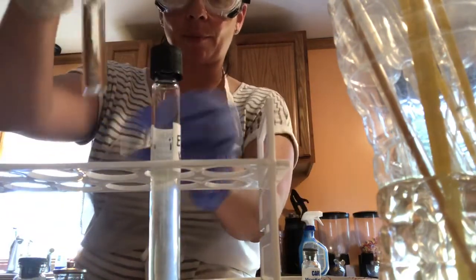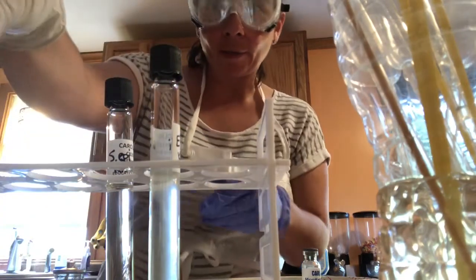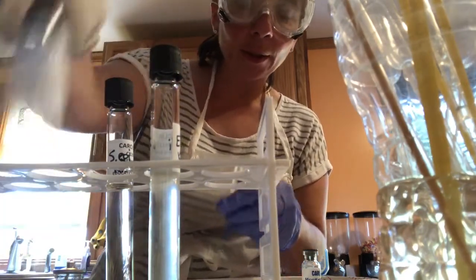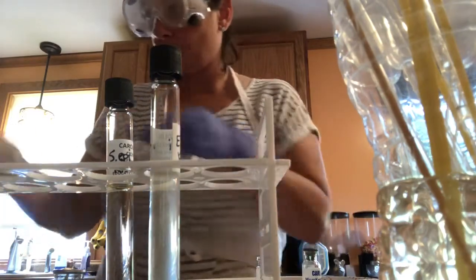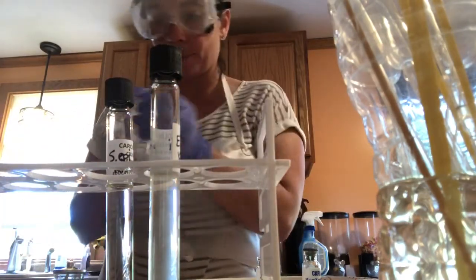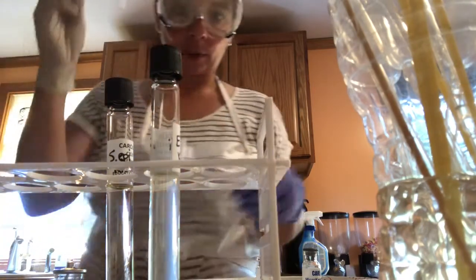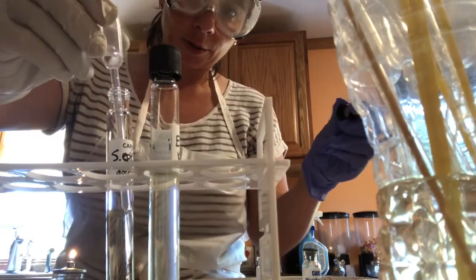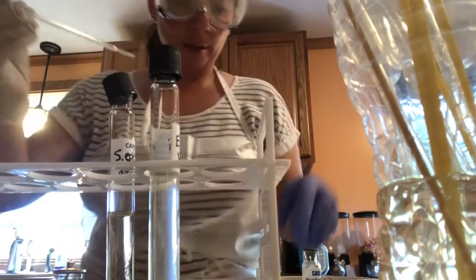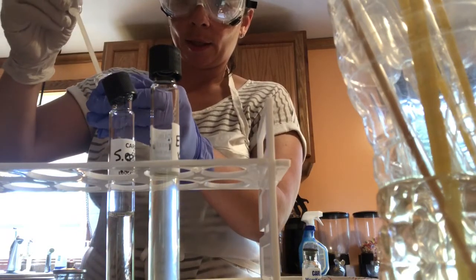Now I'm gonna do the same thing with my Staphylococcus epidermidis. Okay, I have this tube, whoops, right here. I'm gonna open it up, grab a new transfer pipette. Okay, gonna go into the nutrient broth. Close that back up. Go into my vial of Staph Epi.